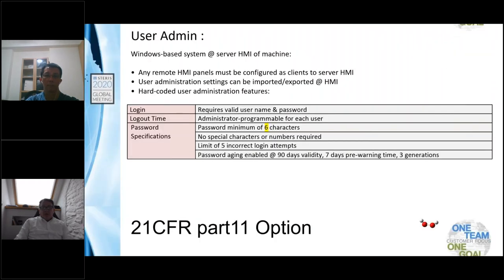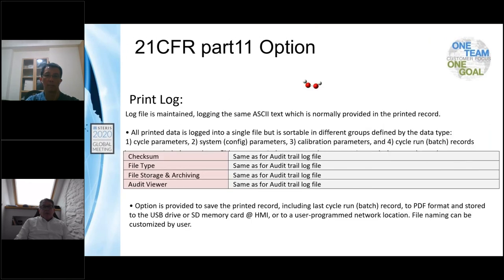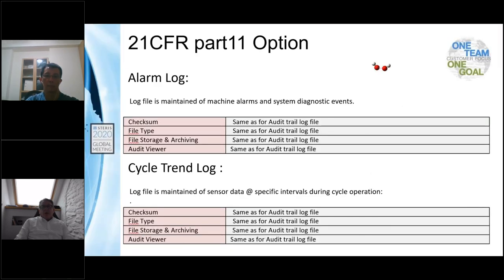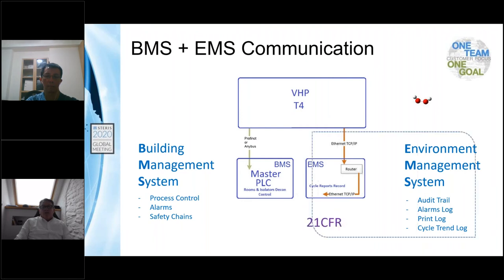But also we have the audit trail, the print log, the alarm log, cycle trend log, and all this can be fed to the building management system and environment management system. Since most of the time the equipment can store all this data on itself, but it can be pushed to anywhere in your system, in your building management system as a storage.